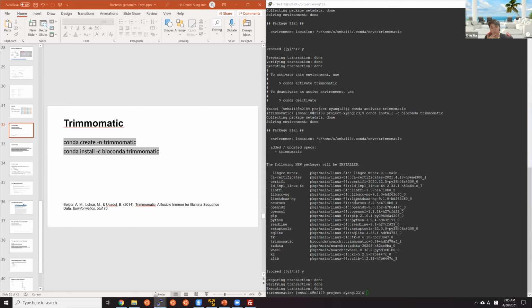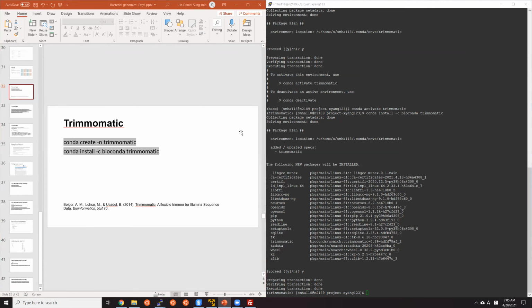You said it runs for 6 hours? No, the typical, I think for the assembly, it takes like 1 to 2 hours to complete. But I just reserved the 6 hours just to make sure we get extra time.